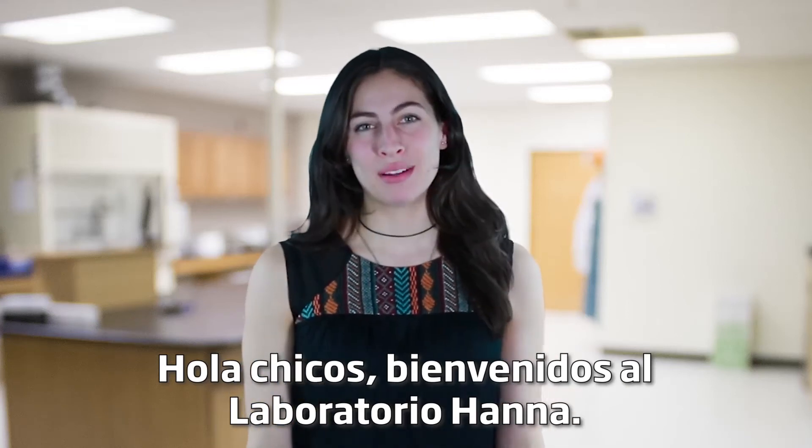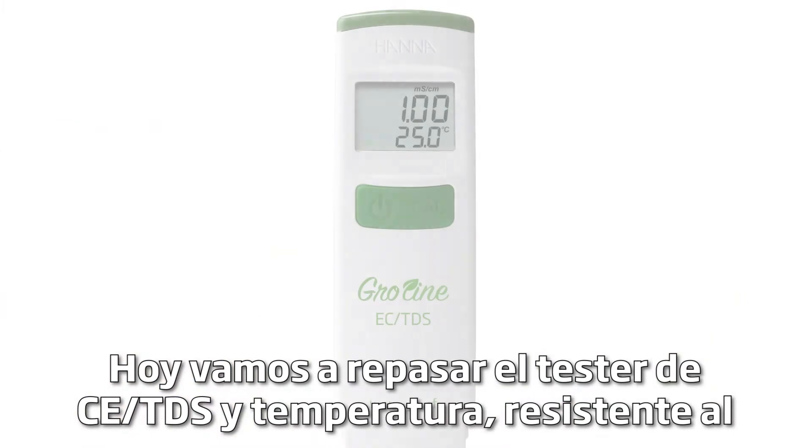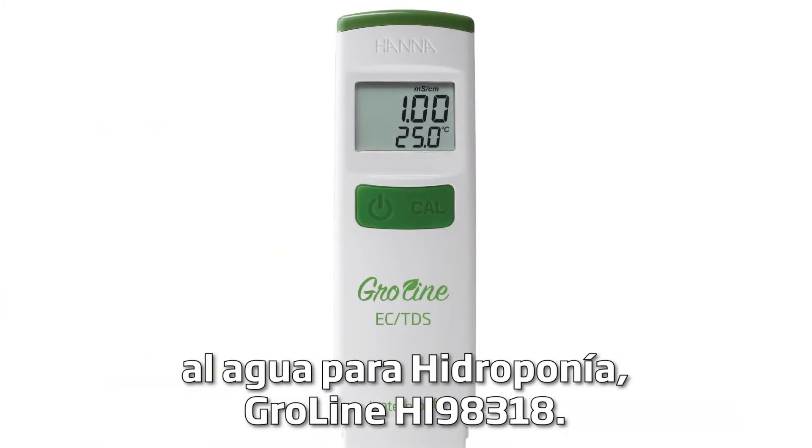Hey guys, welcome to the Hanna Lab. Today we're going to go over the waterproof HI-98318 GroLine EC-TDS and temperature tester for hydroponics.